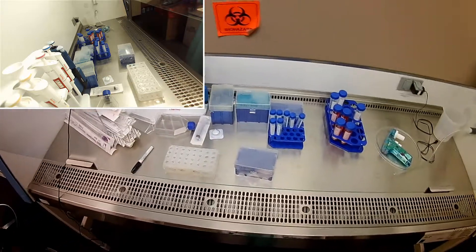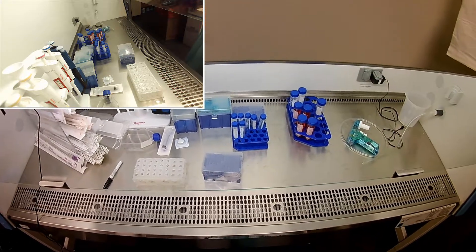Hi everybody. So this is Dr. Dan here, and today we are going to seed the cells for our cytotoxicity assay.